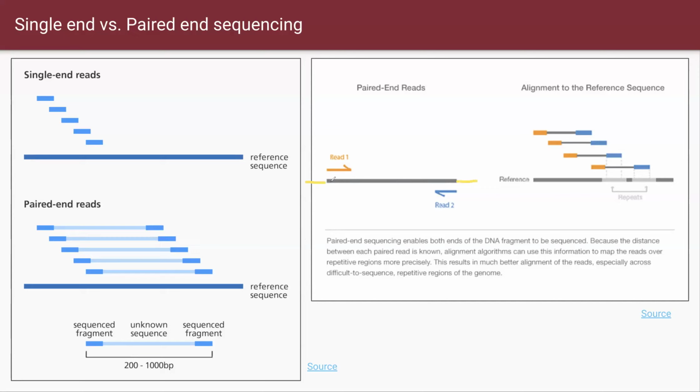Adapter here, and this is the DNA fragment. Then you can read this position, you can read this position. If you read just one time, we call this a single-end read, right? One end and just one read. So it's single-end, and the read is this one, okay?